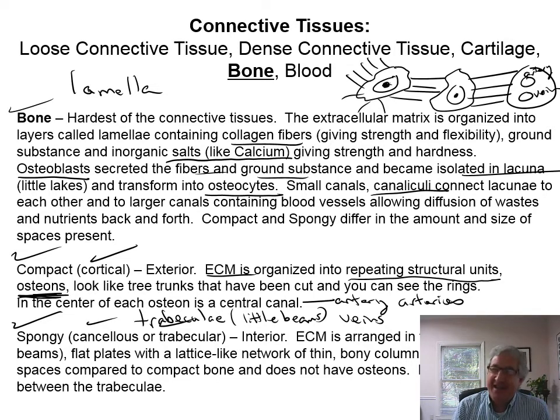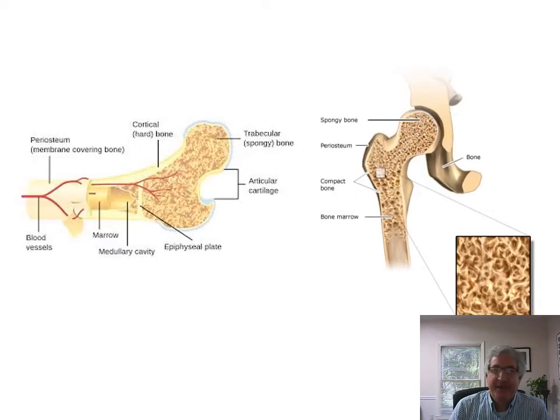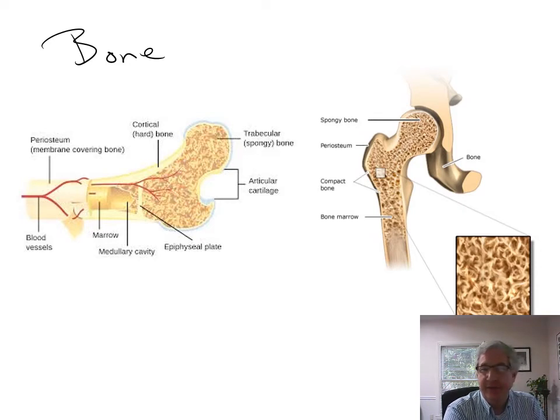All right, next slide. So here we go. This is bone. This is the end of a long bone, and this would be the end of the femur. So this is the femur here.